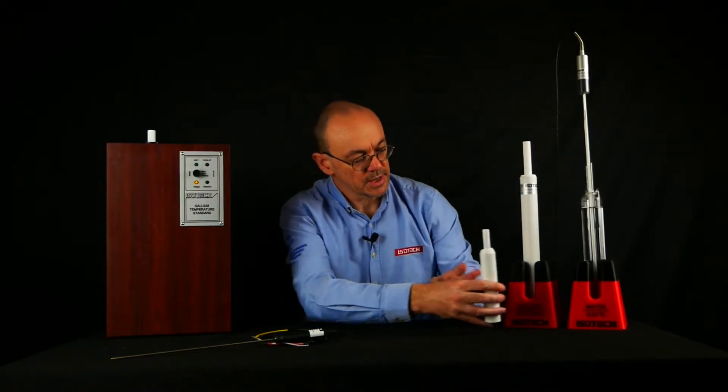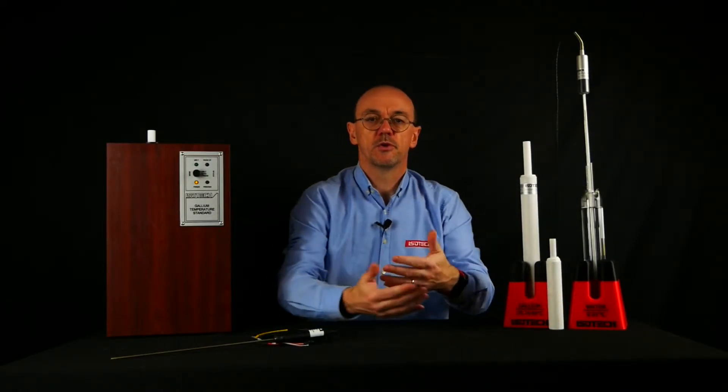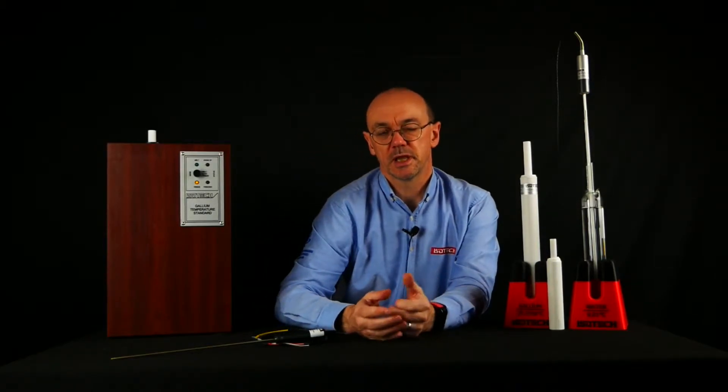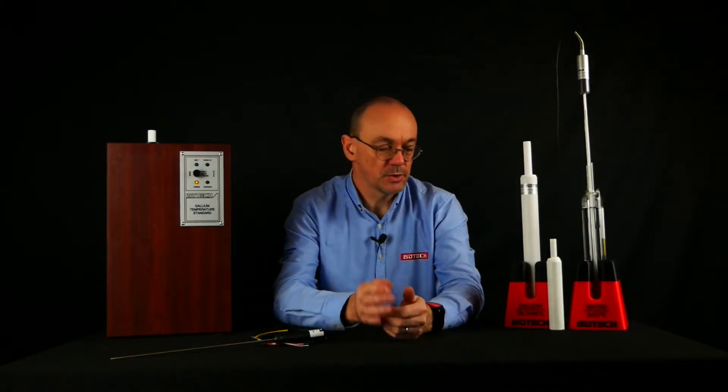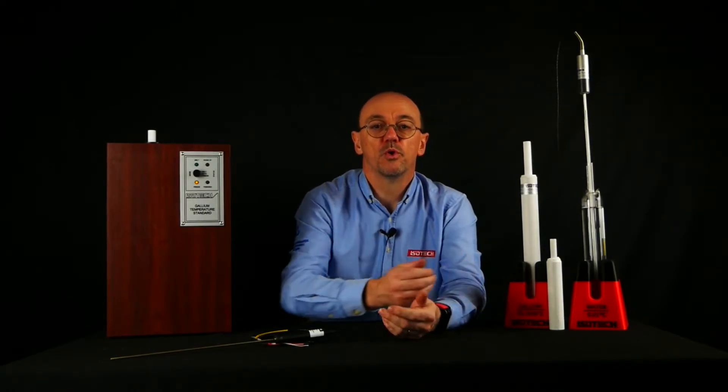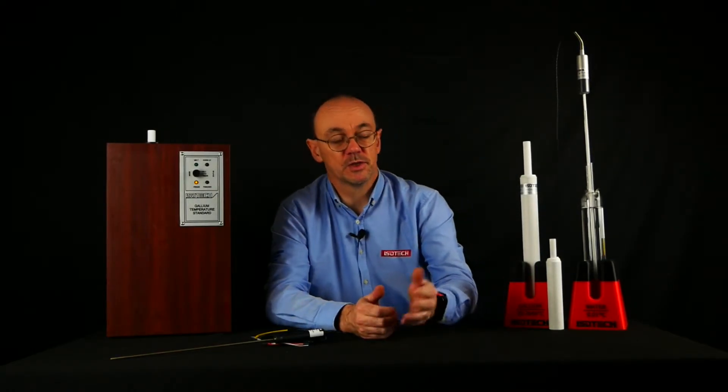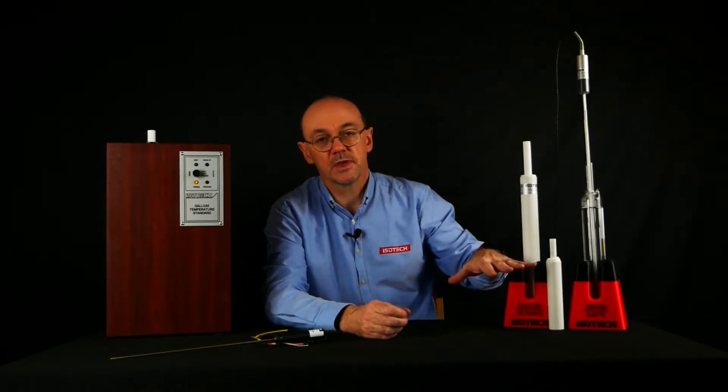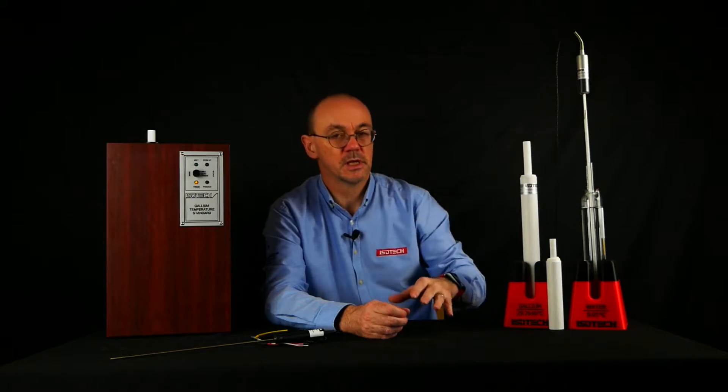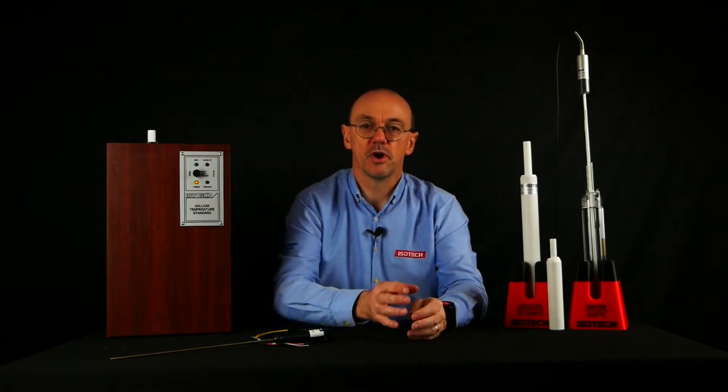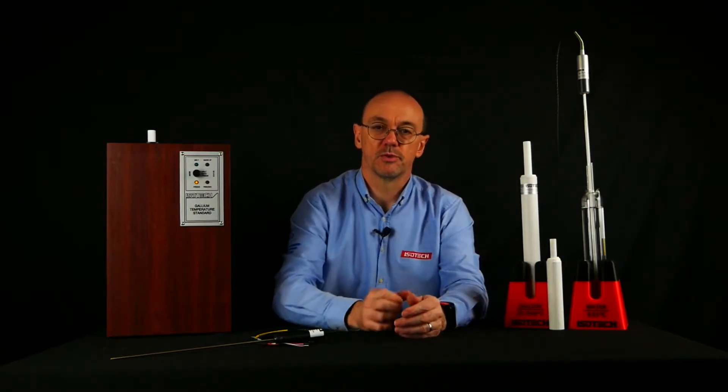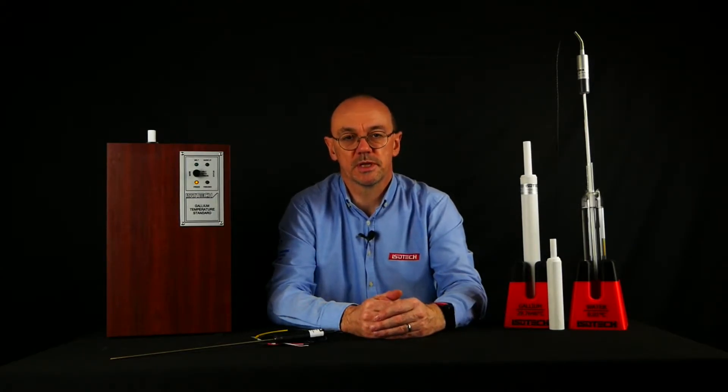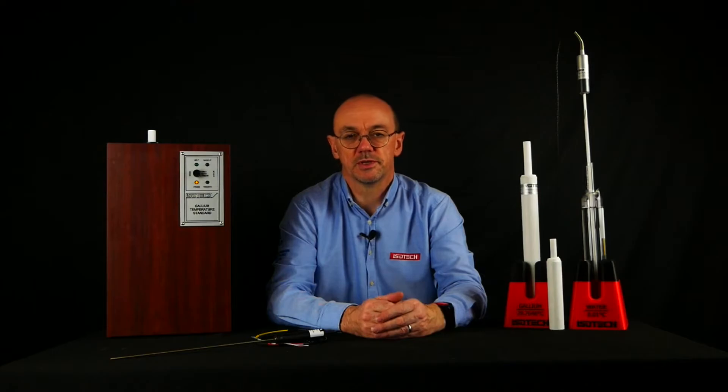These cells are sitting here at room temperature. In order to use them as a calibration point, we need to be able to melt and freeze the gallium inside the cell. I could do that very simply with hot water, a dry block calibrator, or perhaps a liquid bath. If I put the Isotech cells into liquid, I do need to make sure they stay dry - that the water is not in direct contact with the cell. There are application notes on the website about using the cells in a simple way.